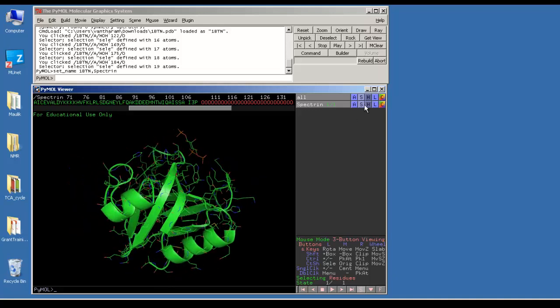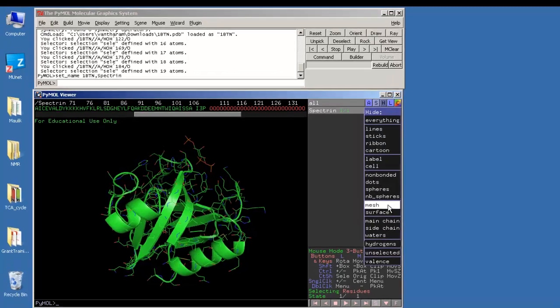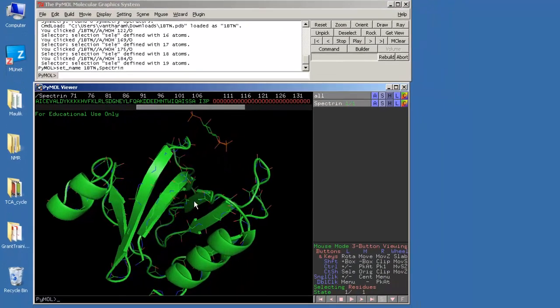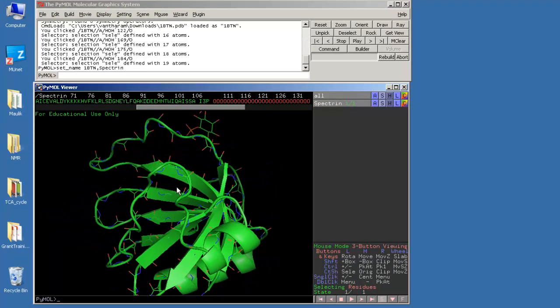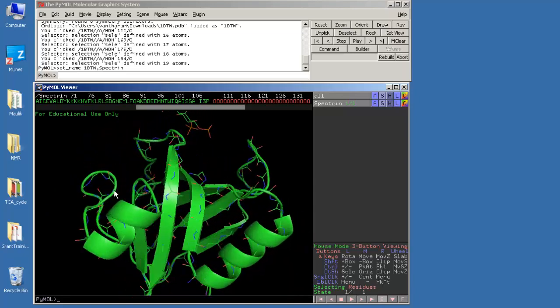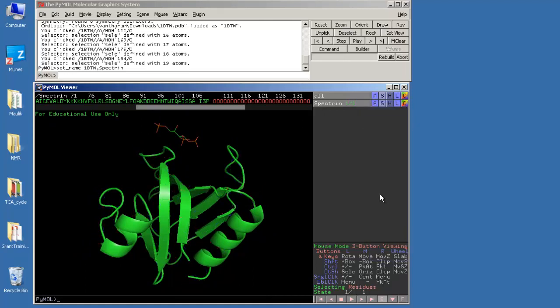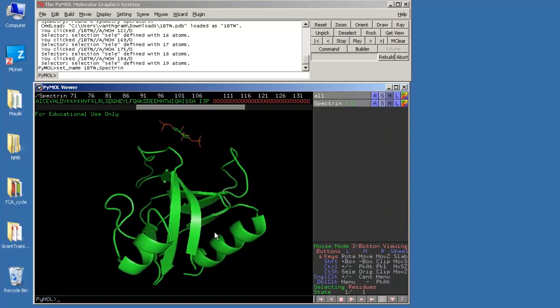For now, what I will do is just hide the side chains. And now I've hid the side chains. And what do I have still remaining as lines or sticks? You should realize what you have remaining as the lines or stick representation is the peptide backbone. So we'll hide the main chain. We've already hid the side chain. And now we have the pleckstrin homology domain of this protein known as spectrin.